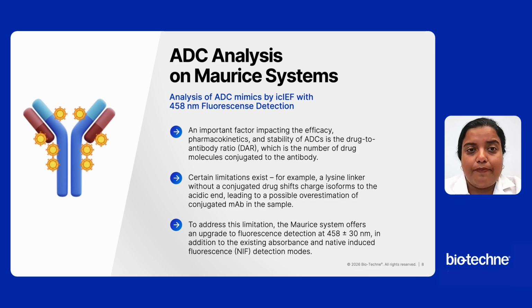Now, the lysine-linked drug conjugates, for example, have charged isoforms that are more acidic, and icIEF is a useful method for assessing the amount of unconjugated mAb relative to the conjugated mAb and for providing a rapid way to monitor conjugation-related changes. However, certain limitations still exist, as lysine linker without a conjugated drug also shifts charged isoforms to the acidic end, leading to possible overestimation of the conjugated mAb in the sample.